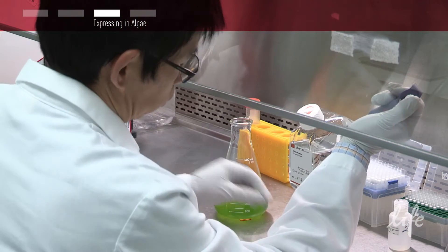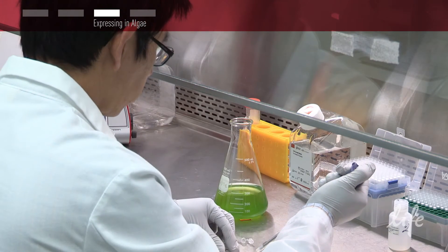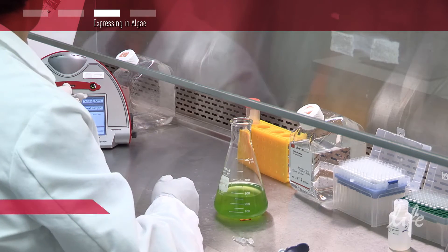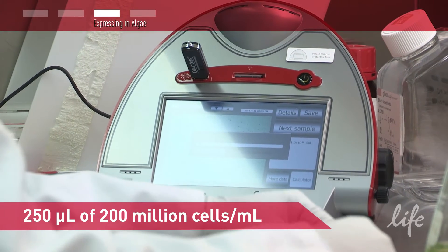After the 3-day culture, you need to count the cells available. You need to know the amount of cells per ml to calculate your concentration. You will require 250 microliters of 200 to 300 million cells per ml for electroporation.